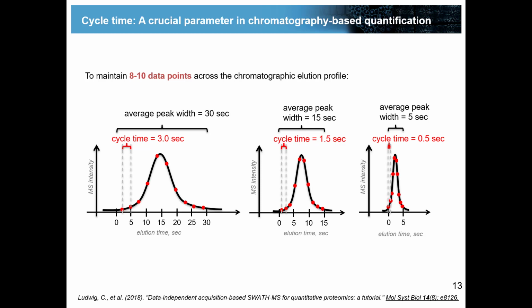Yeah? I don't know, has it been implemented by now as a requirement for publication, or is it still kind of a suggestion? You mean into the acquisition software, so that it automatically recognizes that? Like for MCP, you need to report how many data points you have if you have quantitative proteomics, because people talk about this a lot. Is it really a rule by now? I don't think this is a rule by now.